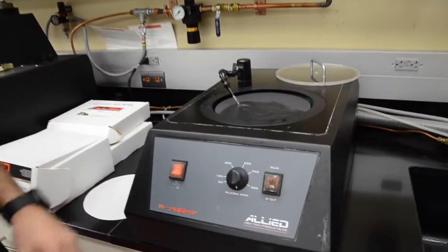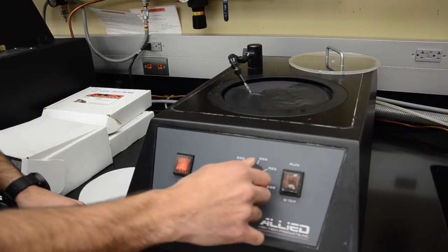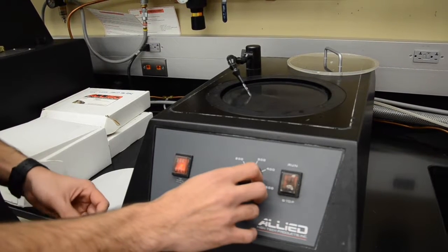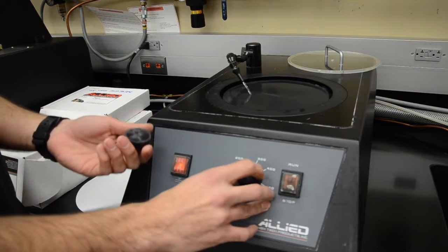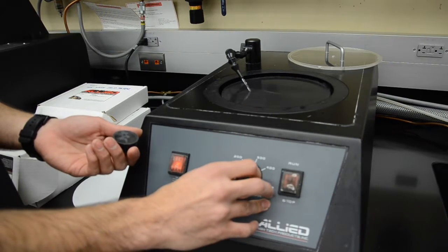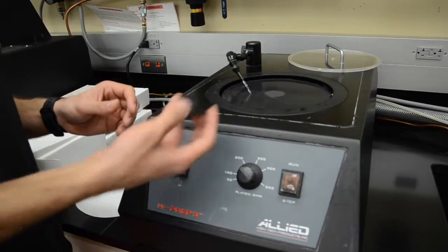This will start the platen to run. Here you control how fast the platen is moving or the RPMs of the platen. For manual grinding, I don't suggest going higher than 250. So somewhere right there should be fine. And you have your sample.